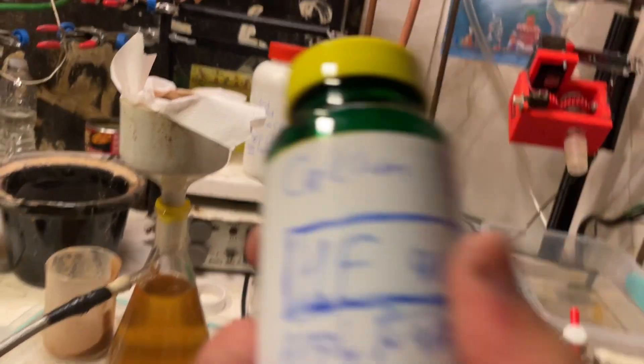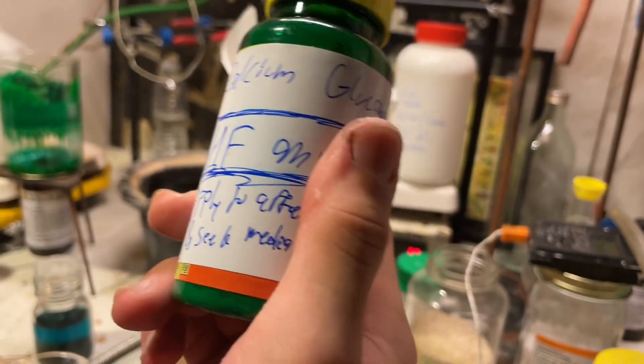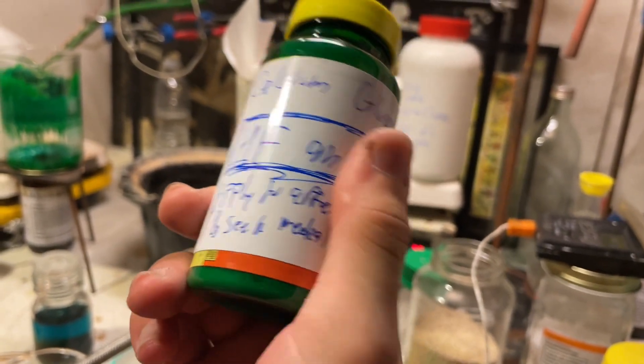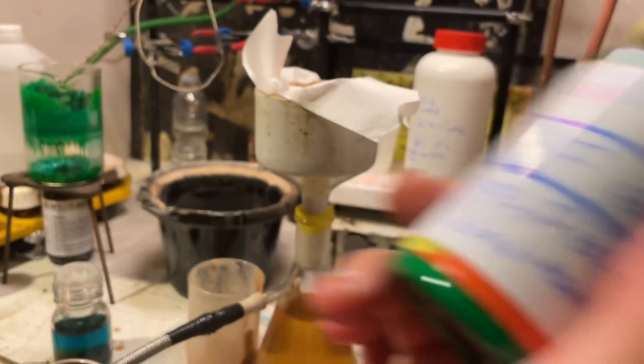It was like $20. So I can buy a kilogram of calcium for the price of one tube of that stuff. I looked at the MSDS for Calgonate, it's proprietary but nothing in here is harmful. I looked at some other MSDSs for the same exact thing, calcium HF burn gel.